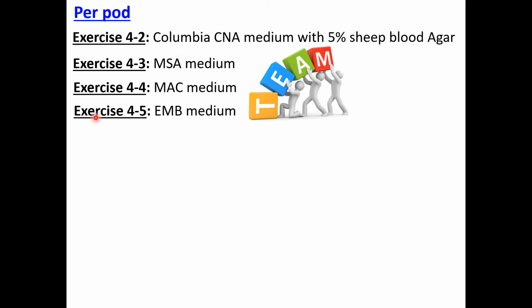Okay, so today we would learn four different types of lab techniques, and those are listed here. So we are going to work with four different types of media, okay? And we'll do this as a pod, and you guys would split the work. If we have four people on the pod, each person could just take one media and work on that, because basically we do the same thing but in different plates, okay?